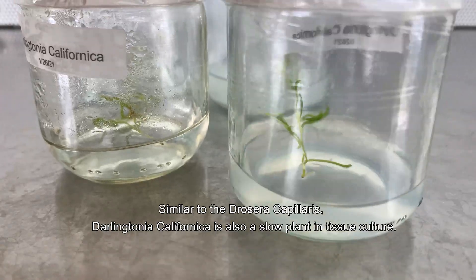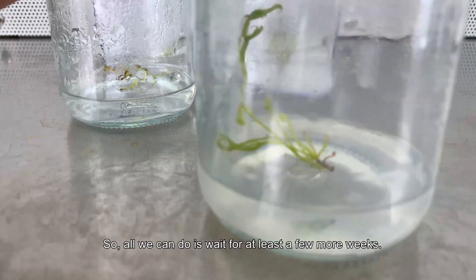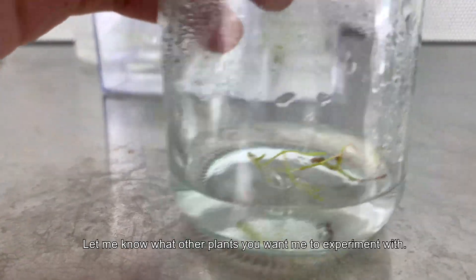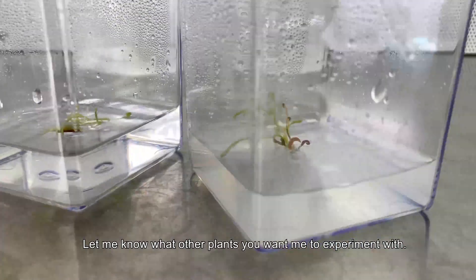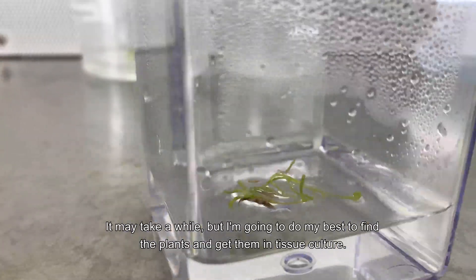Similar to the Drosera capillaris, the Darlingtonia californica is also a slow plant in tissue culture, so all we can do is wait for at least a few more weeks. Let me know what other plants you want me to experiment with — it may take a while, but I'm going to do my best to find the plants and get them into tissue culture.